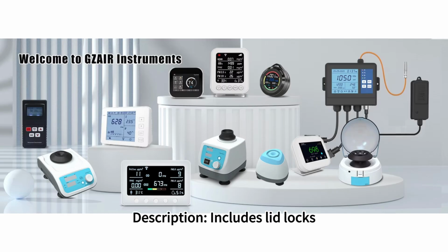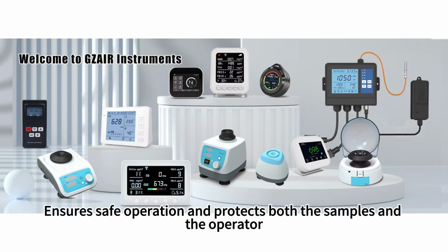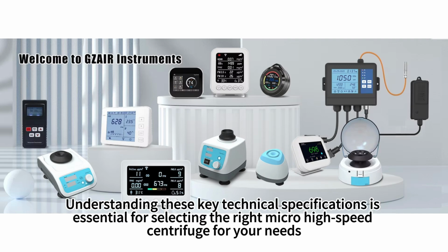Safety features. Description: includes lid locks, imbalance detection, and automatic shut-off mechanisms. Importance: ensures safe operation and protects both the samples and the operator. Understanding these key technical specifications is essential for selecting the right micro-high-speed centrifuge for your needs.